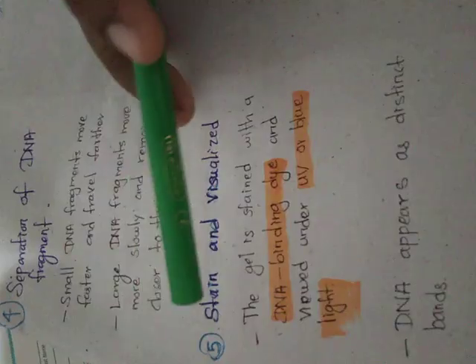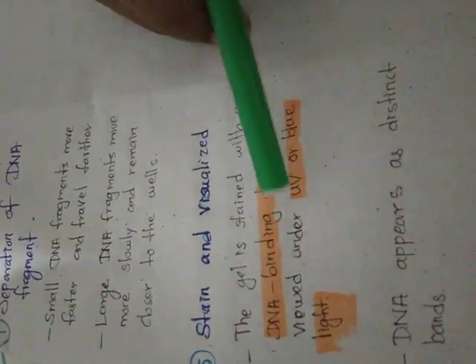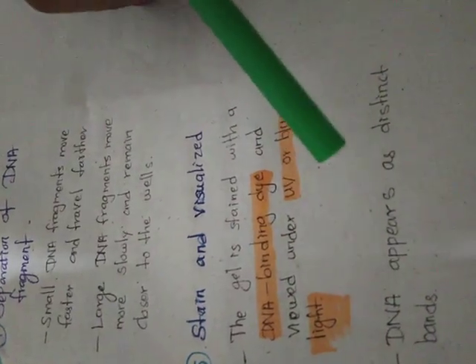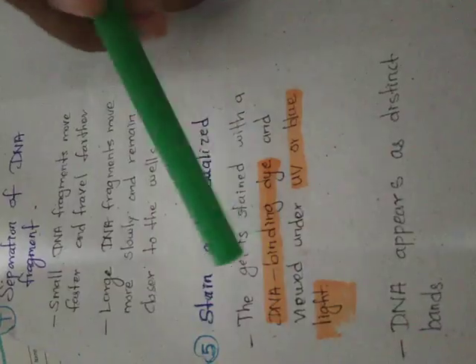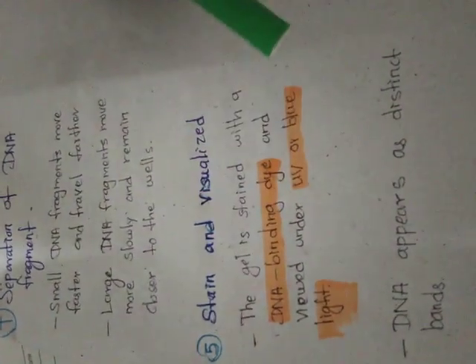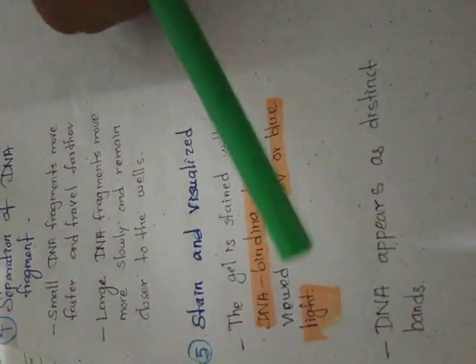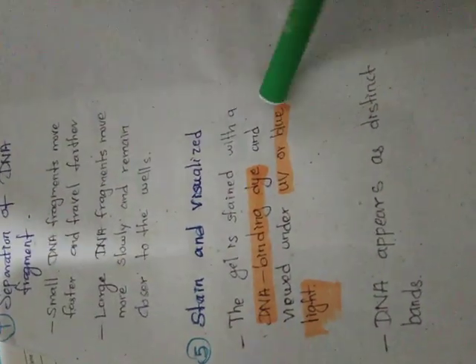So first we add the dye and view under UV or blue light. DNA appears as distinct bands. After we put the dye and view under UV or blue light, distinct bands are observed.